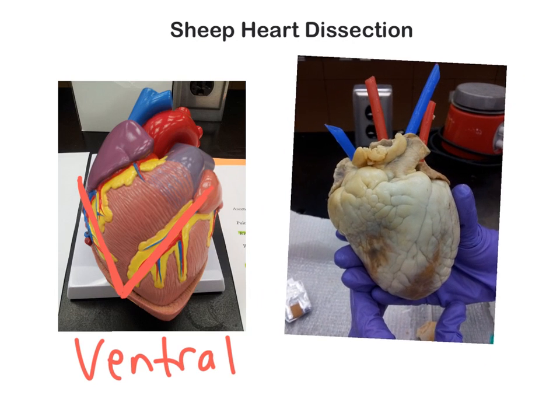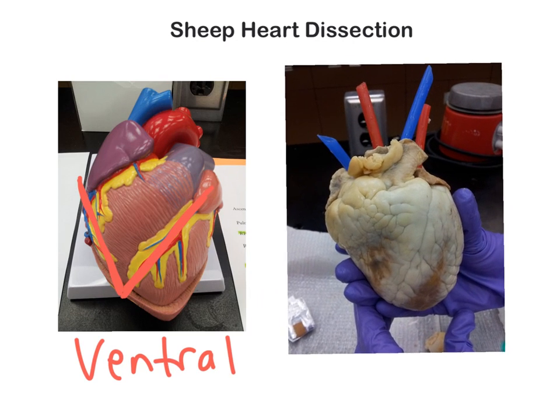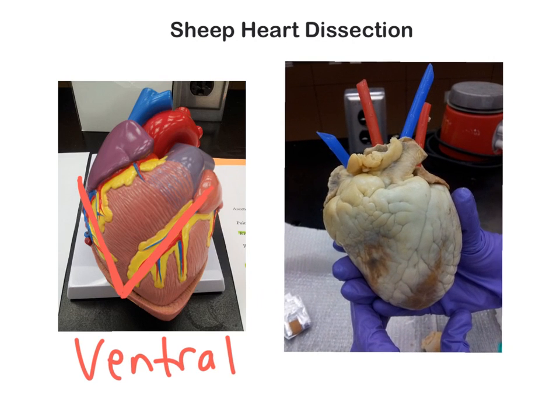Here is the actual heart, and let's take a look and see if we can see that V. There it is right there — the anterior interventricular branch of the left coronary artery, and there is the V. So V is for ventral; now we know which is the anterior surface of this heart.